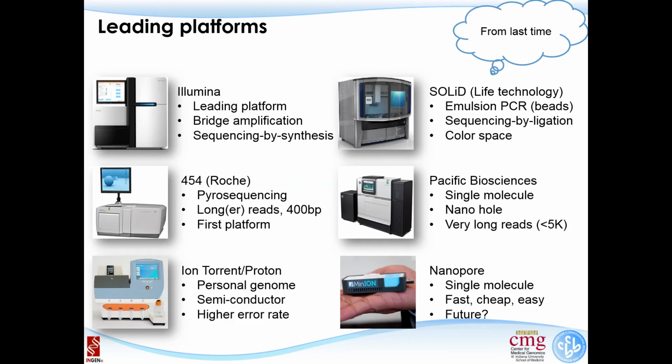But similar to some other technologies, especially third generation sequencing technology, their error rate is very, very high. So it depends on what we need to use them for. Sometimes if you use that to do genotyping, to identify SNPs, their accuracy is not accurate enough.